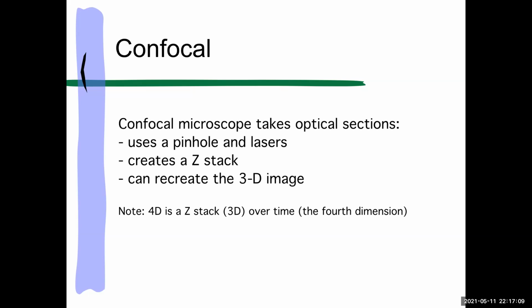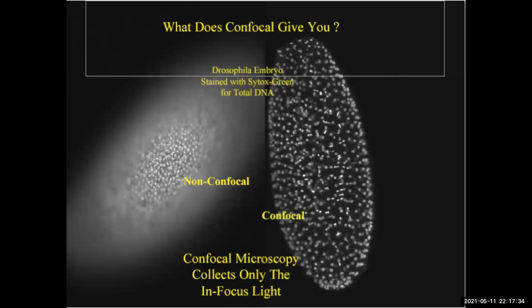You're using physics tricks to look inside of it, basically. And obviously it can be thicker than something you would be able to see with wide field, but it can't be as thick as, like, say, an entire finger. So we're talking like 100, 200 microns thick. A cell itself is about 10 microns thick. This embryo is probably 200 microns thick, this entire embryo.